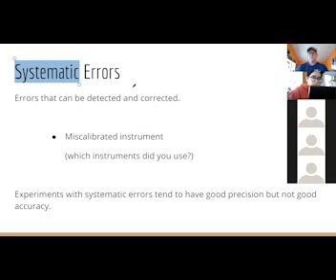0 degrees Celsius. 0 degrees Celsius, right? Whenever you give an answer to a question like that, you have to have the number and the unit. So, right, 0 degrees Celsius, freezing point of water. So I take my newfangled thermometer that I just invented, and I put it into 0 degrees Celsius.